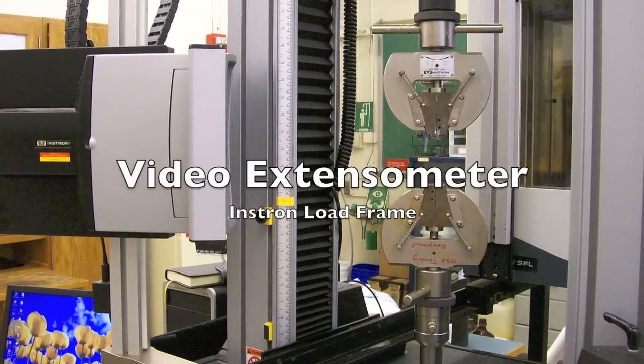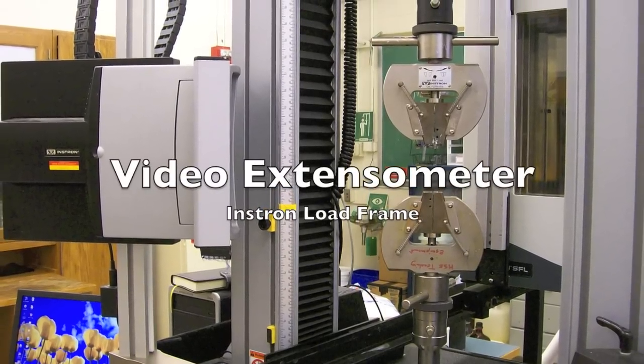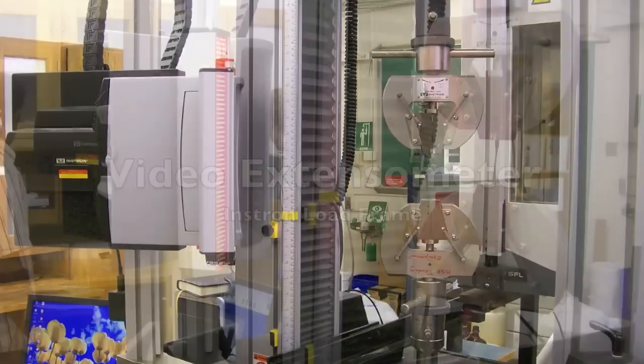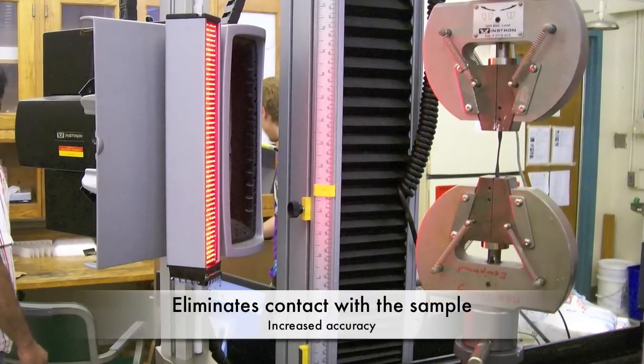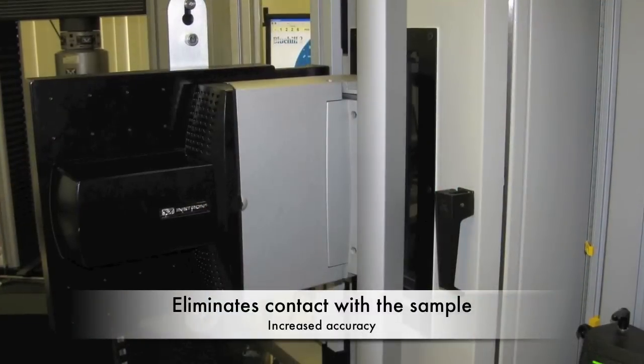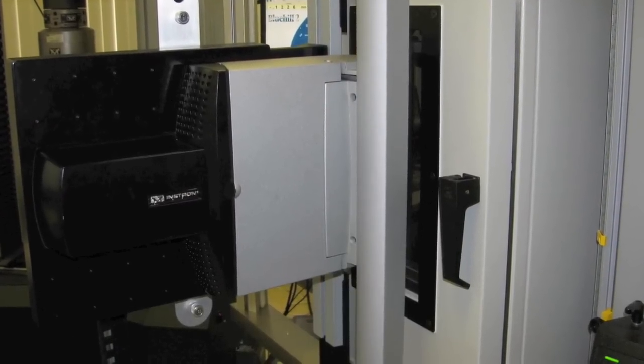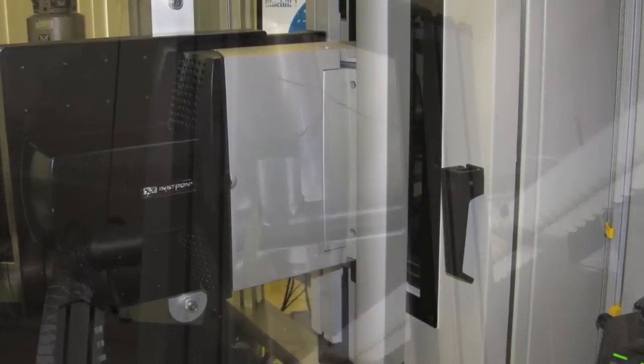The video extensometer is used with the INSTRON load frame to measure strain during a tensile test. This method eliminates all contact with the sample by precisely measuring the strain with high-resolution video. The advantages of this method include no influence on the specimen and increased accuracy by eliminating errors caused by moving parts.